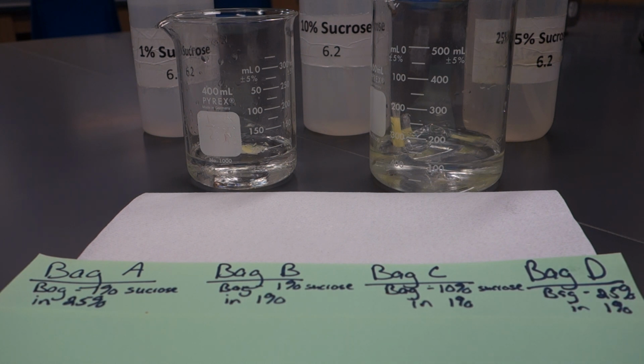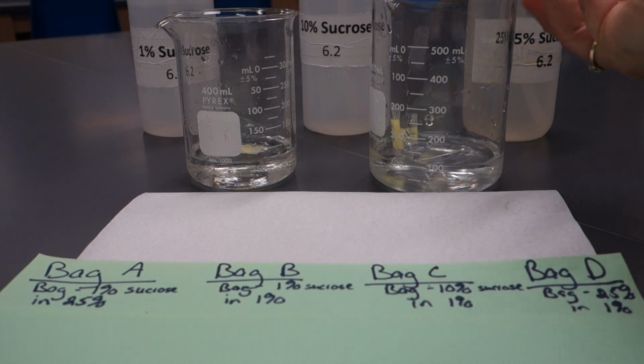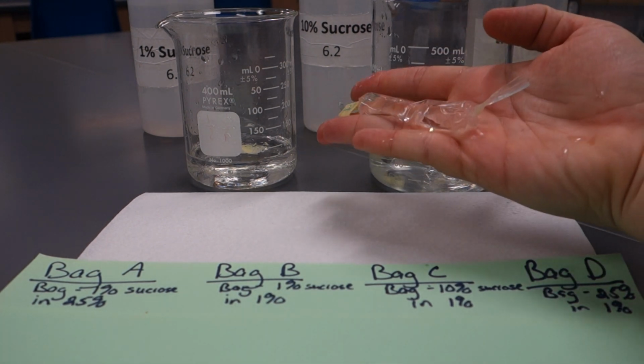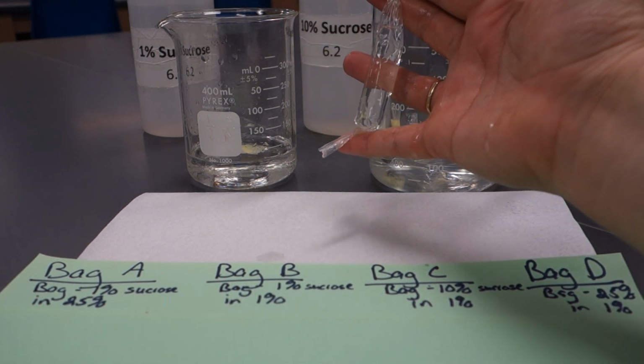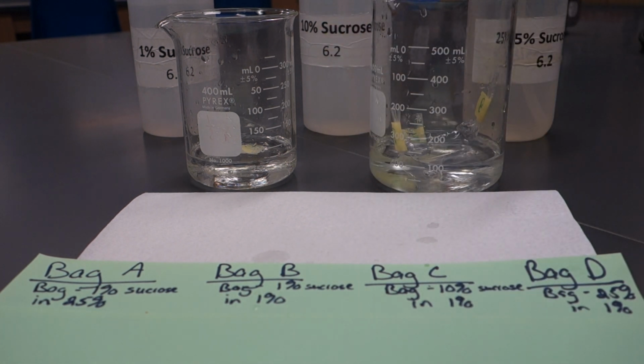So in this experiment, you are creating 4 different environments. You're going to be using 4 different bags, which are going to mimic cells, right? So you're going to be using the same dialysis tubing that we talked about for 6.1, right? This dialysis tubing has pores in it that will allow some substances through, but not others. In this case, we're going to be using water and sugar. So the water is small enough to move through the bag, but the sugar is not. So the sugar is going to stay on either side of the bag and not influence this experiment.